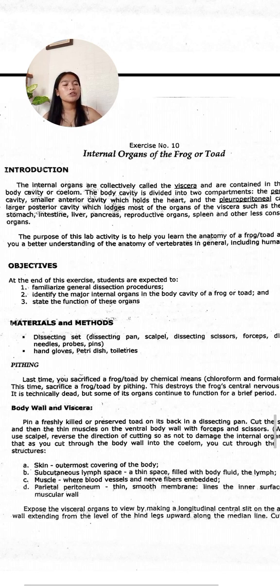There are many organ systems present, such as the circulatory system, digestive system, respiratory system, nervous system, excretory system, and reproductive system. So there are six organ systems inside the body of the frog. All the organs and organ systems are well developed with specific functions.